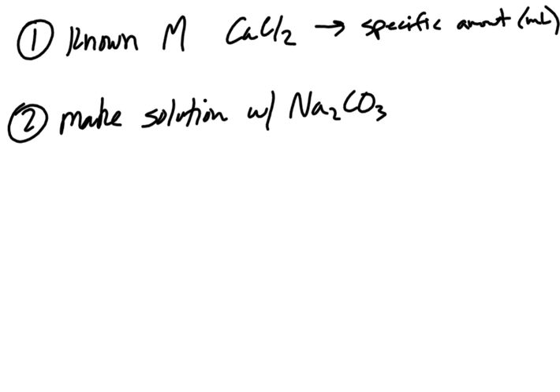So what I'll have right here with the sodium carbonate, I'm just going to throw this number out there. It may be what we use, it may not be what we use. But let's say you're going to use 0.5 to 1.5 grams of sodium carbonate. All you have to do is make a solution, which means you need to add enough water to dissolve it. Again, you may not be using exactly this range, you may not be using 0.5 to 1.5 grams. That may change. But how you make the solution doesn't change, right?